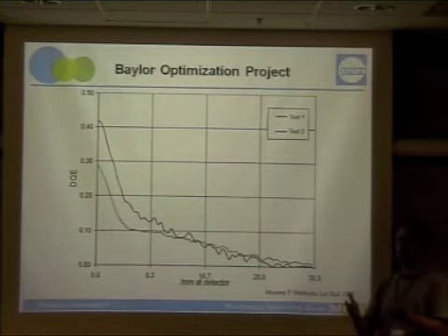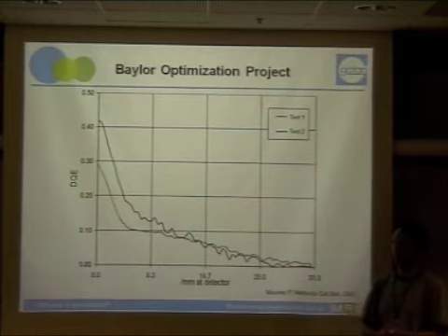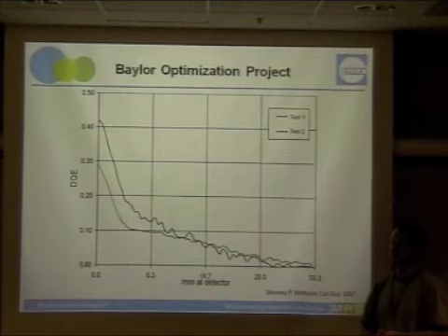If you compare resolution against the number of asymmetric units required to achieve it, it's a bit of an unfair comparison because sometimes you've got viruses and sometimes macromolecular assemblies. But it was interesting to see that some of the virus reconstructions seem to require a lot fewer particles than we needed for some of the other film studies.